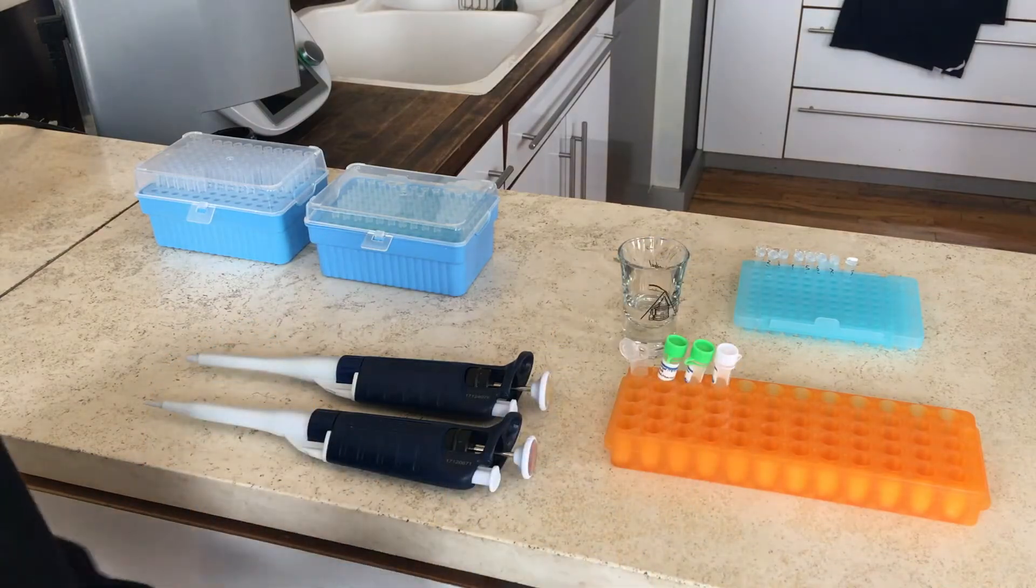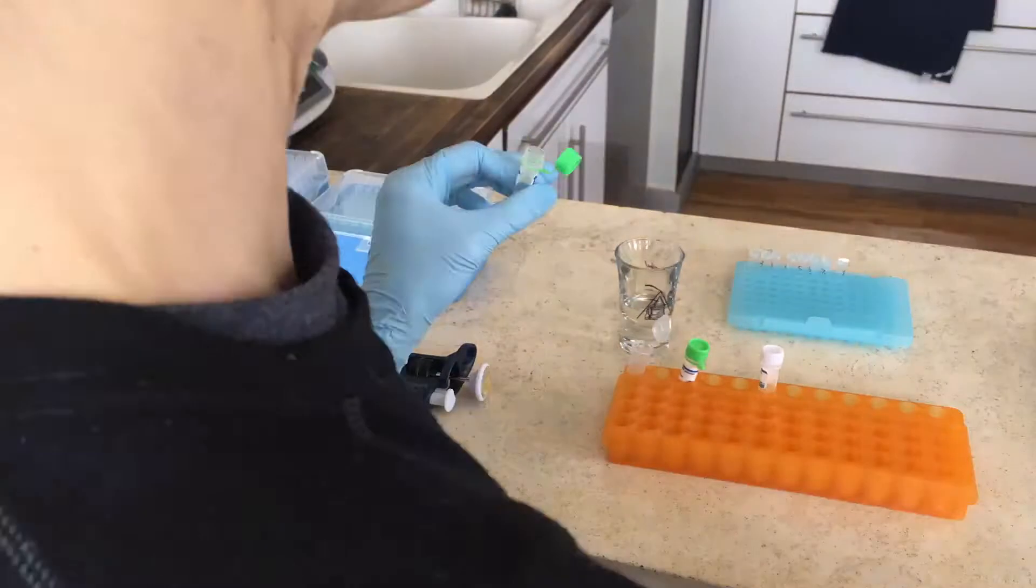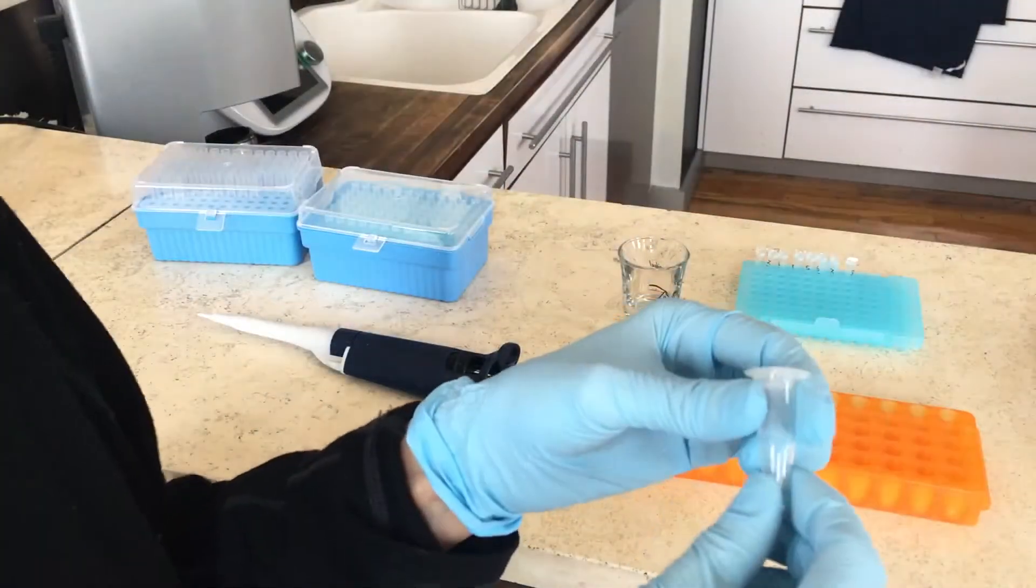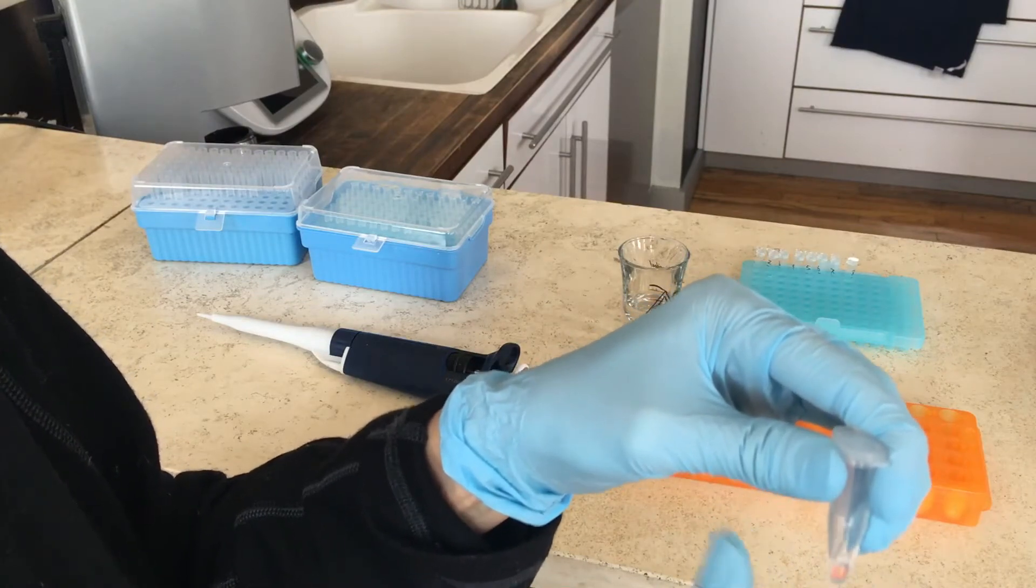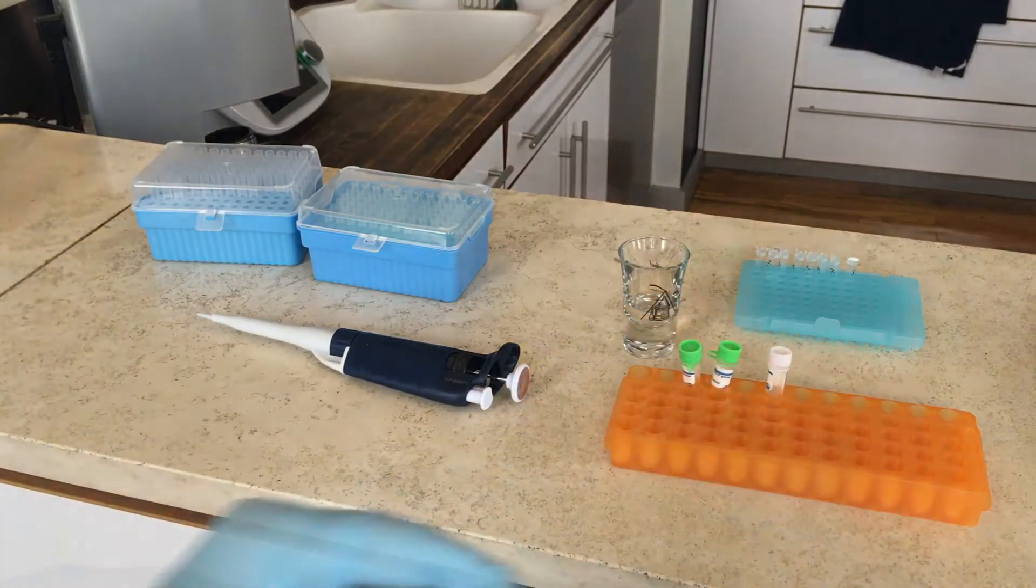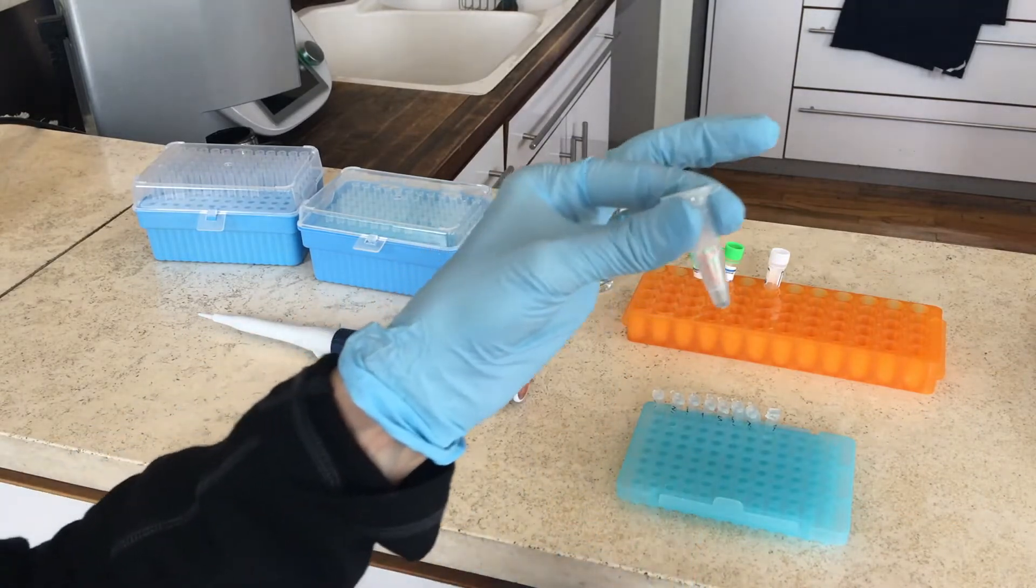Once you have all that in your tube, you're going to flick it a little bit so it all gets mixed together. And then you're going to portion that mix that you got in your tube into the 8 new tubes that you've labeled earlier that are still empty.